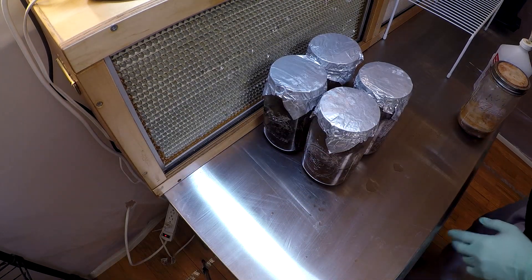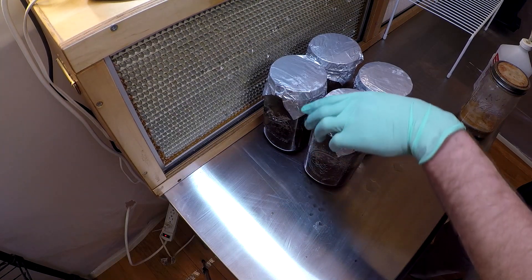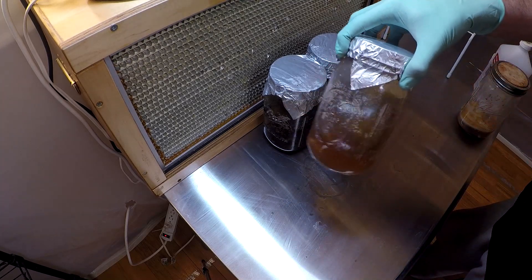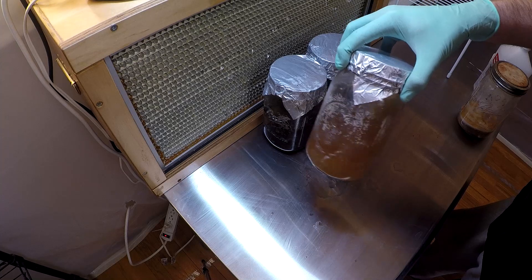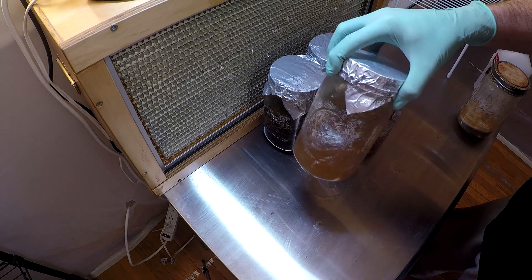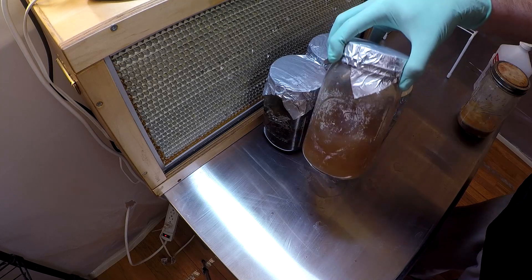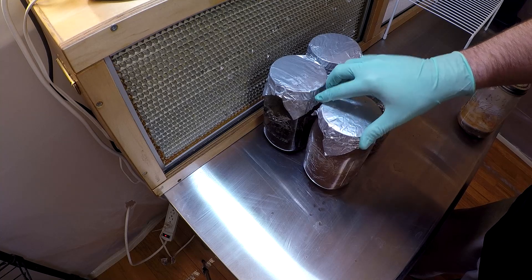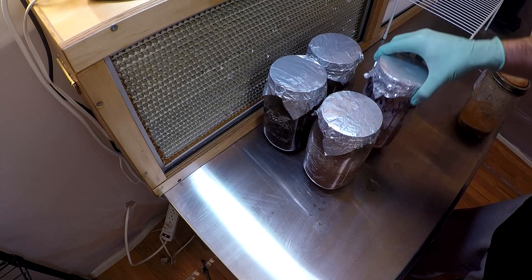We're now ready to inoculate these jars of liquid culture. You can see that the liquid inside has colored a bit with a slight caramelization. If I swirl it around, you can see that the yeast that settled to the bottom kind of mixes up, but we don't need to swirl that yet.